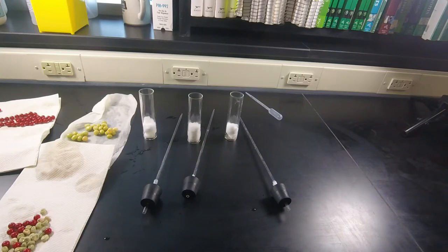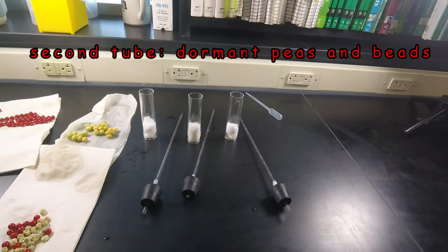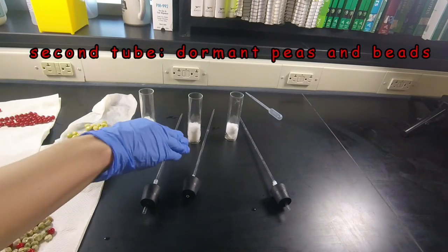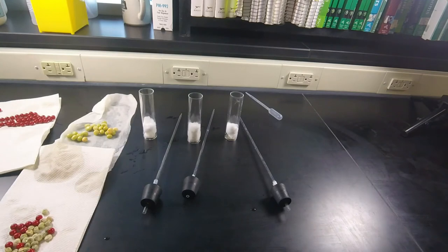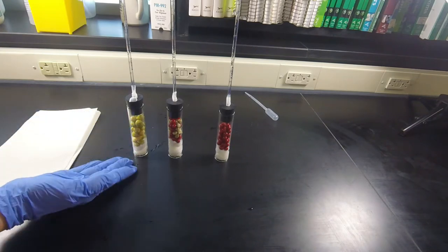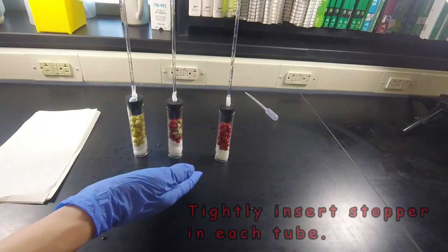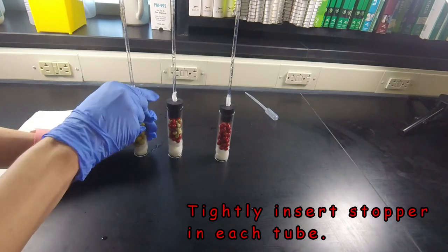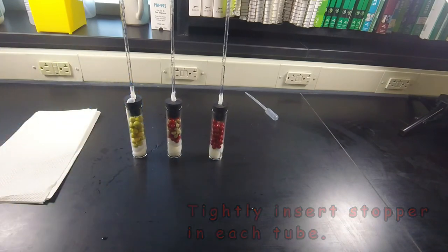Once the non-absorbent cotton is placed, insert the 25 germinating peas into one of the tubes, the dormant peas and the beads into the second tube, and the beads by themselves into the third tube. Once you have filled the three vials with either the germinating peas, the dormant peas and the beads, or the beads alone, insert the stoppers into the vials. Make sure the stopper is tightly in the vials, as you don't want the respirometers to leak.